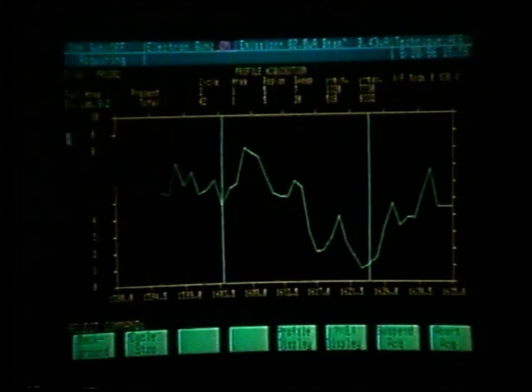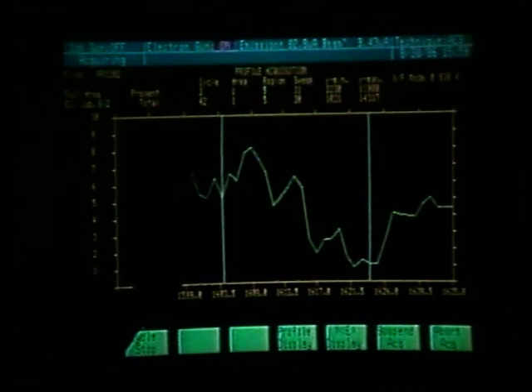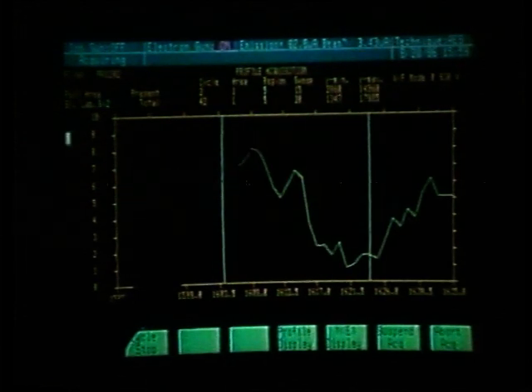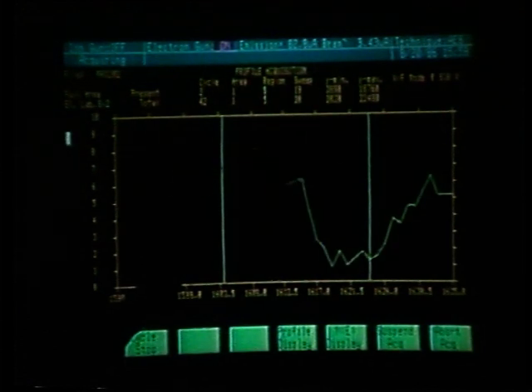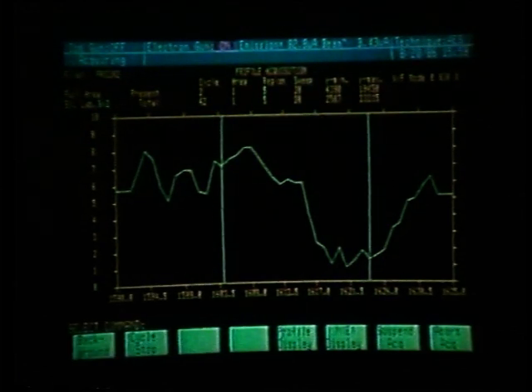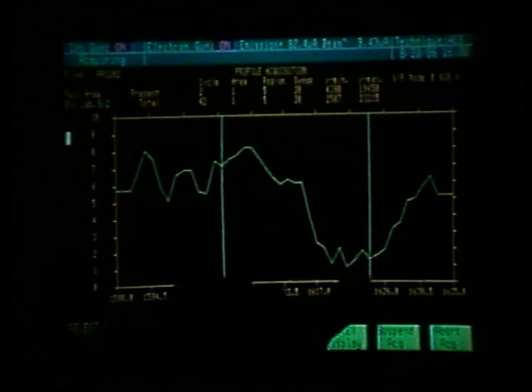Because the carbon peak, this is now the silicon peak, but we'll notice when we come back to the carbon peak, we can also see on the silicon peak that we will have to redefine the negative most excursion.